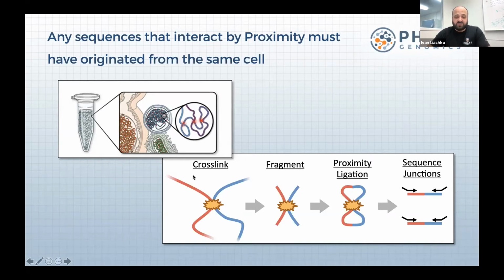Because the way Hi-C works is you take cells when they're still intact and you treat them with a cross-linker, aka formaldehyde. It will cross-link DNA molecules that are nearby each other in 3-dimensional space. But this cross-link happens before the cells are lysed. So if you were to have a mixed microbial community, every Hi-C junction, within statistical limits, hangs out inside the same cell. And so you don't get any Hi-C junctions, presumably, between different cells.